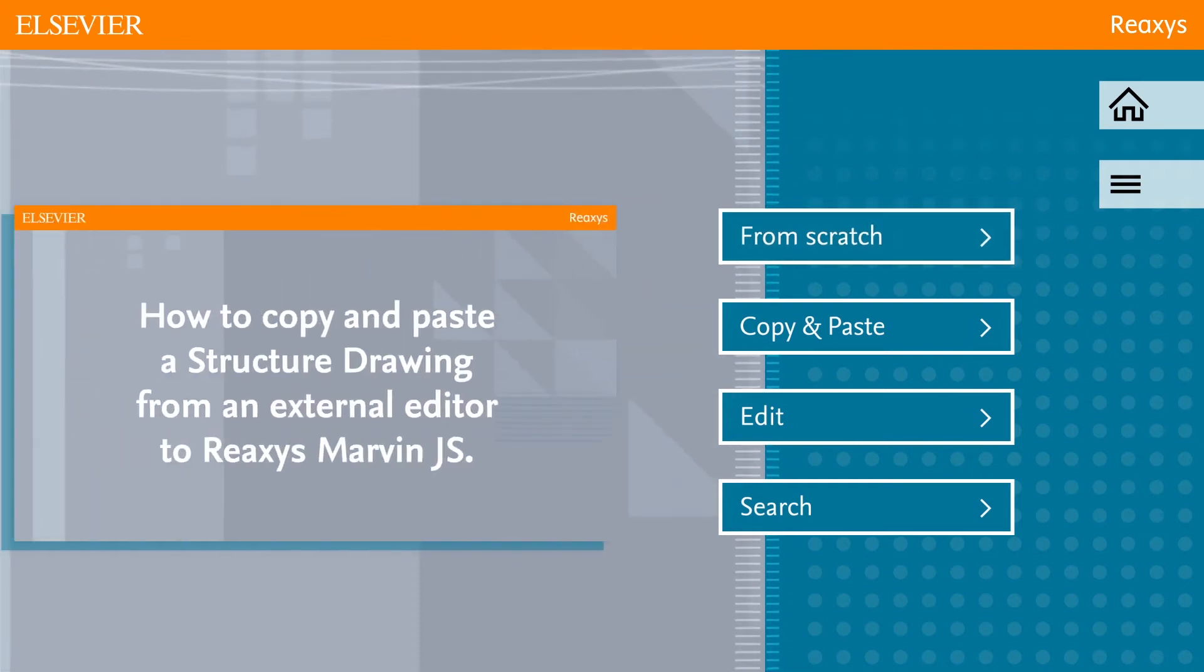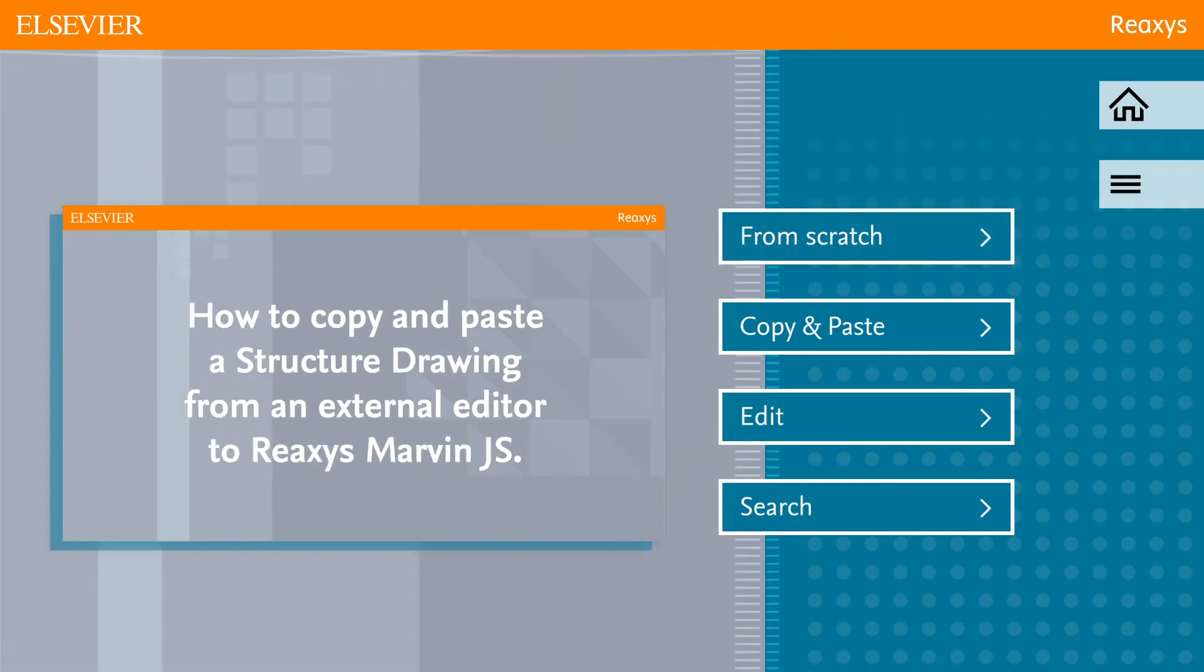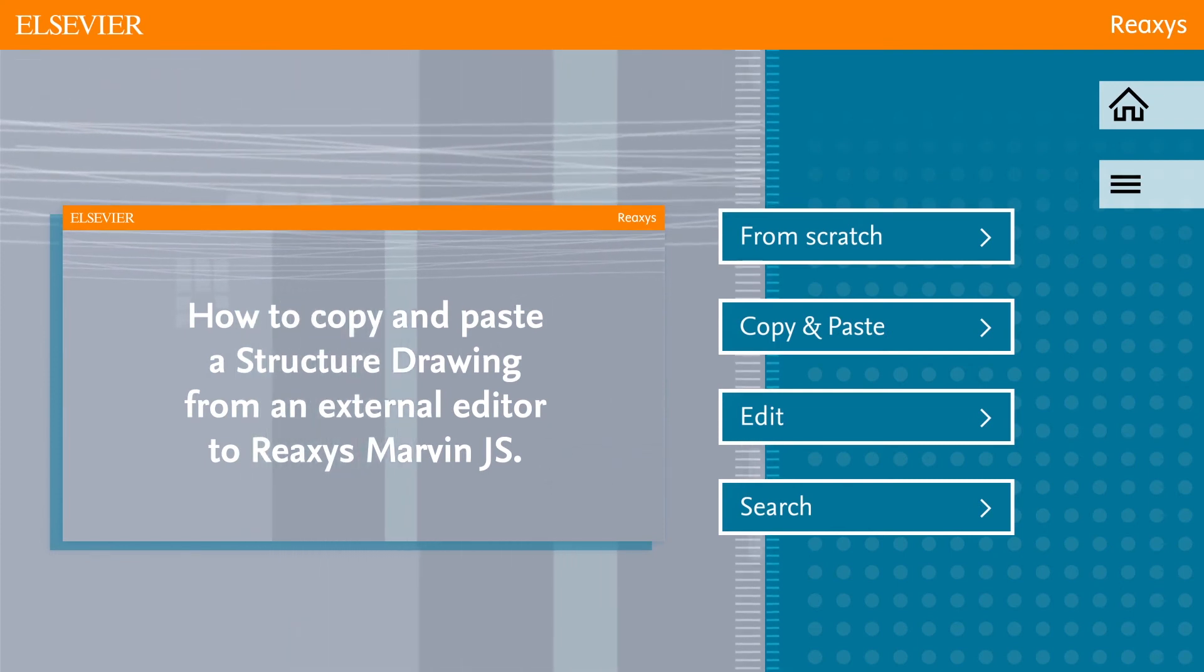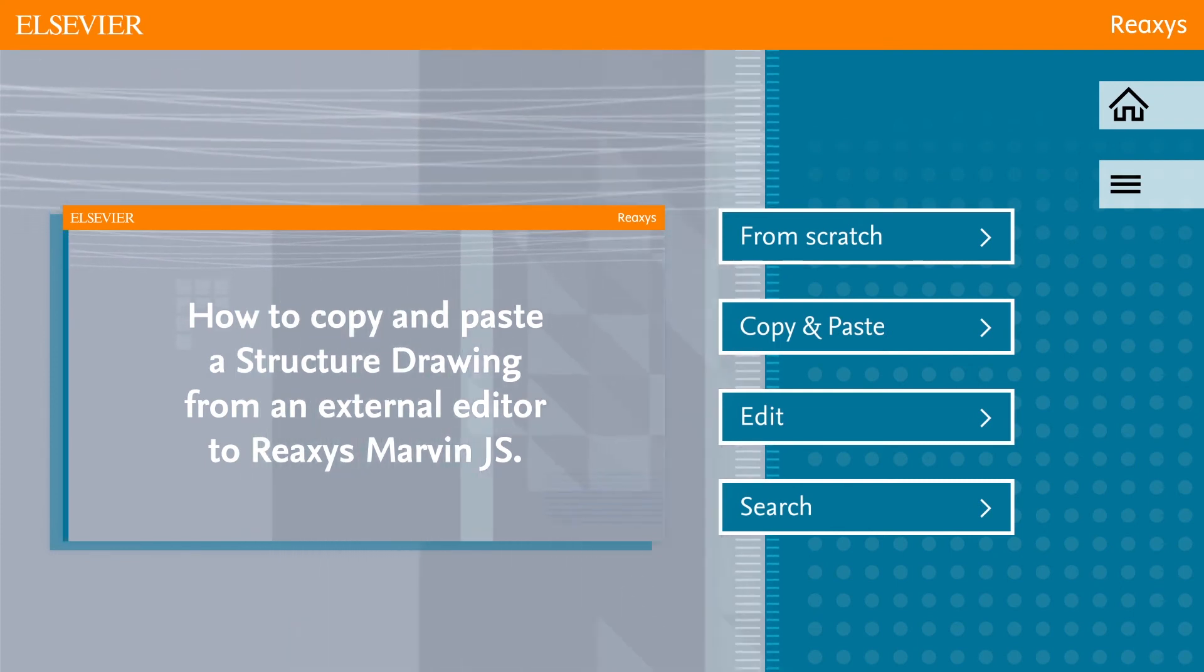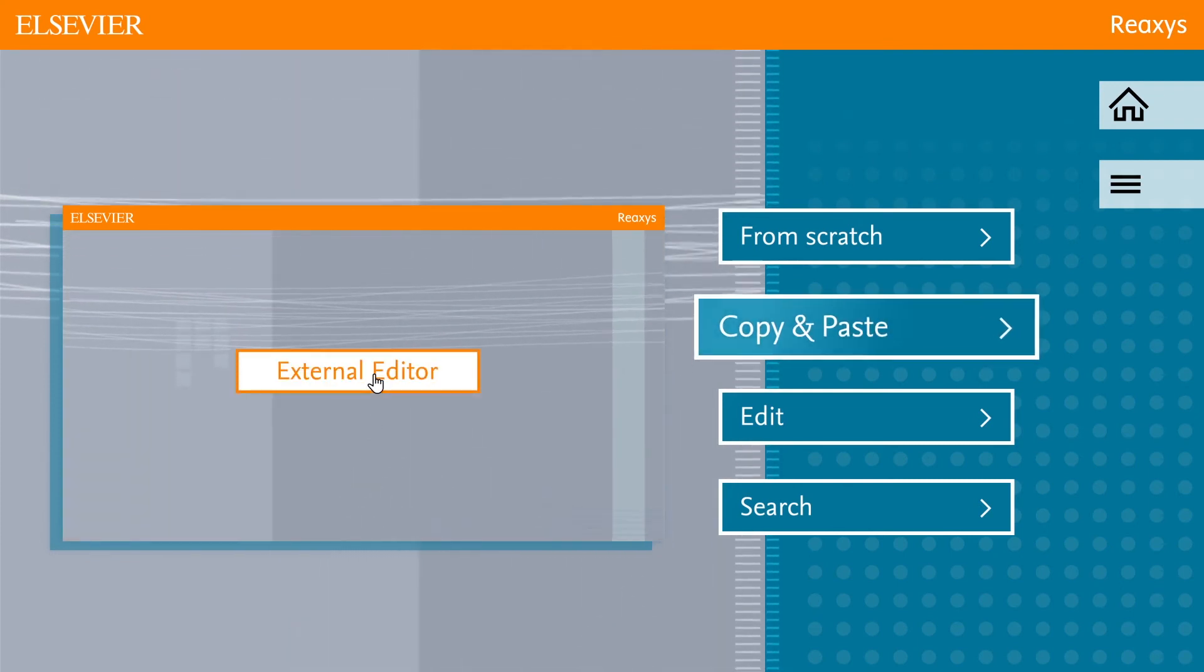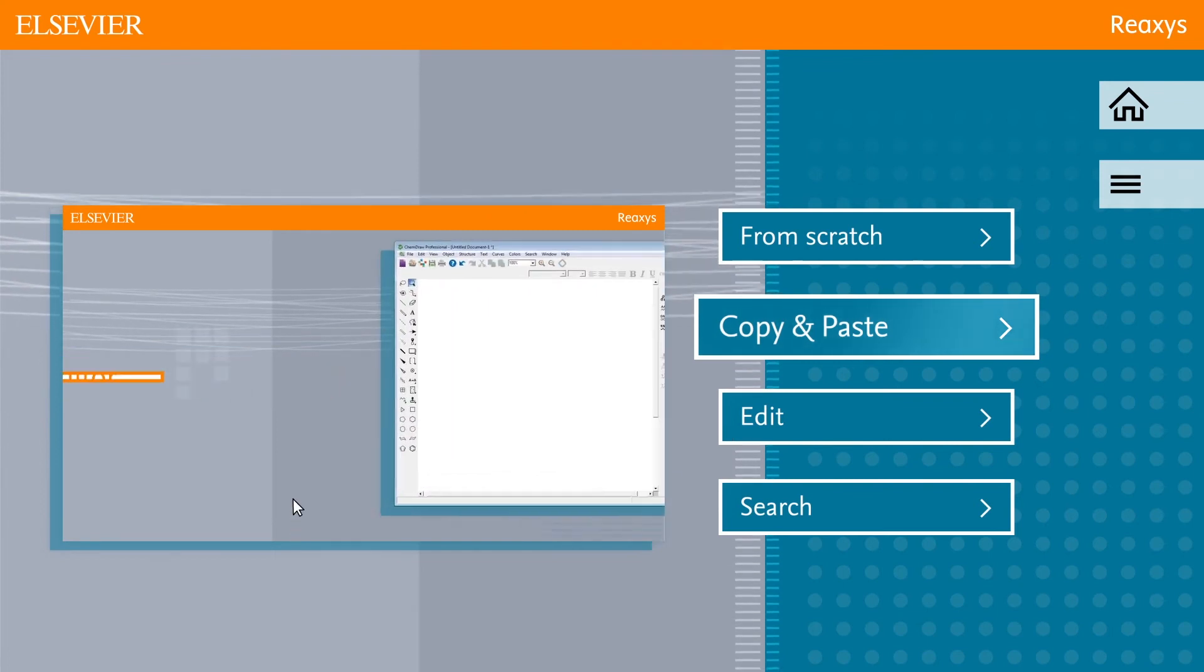Are you interested in copy-pasting a structure drawing from an external structure editor into MarvinJS within Reaxis? Click Copy and Paste.